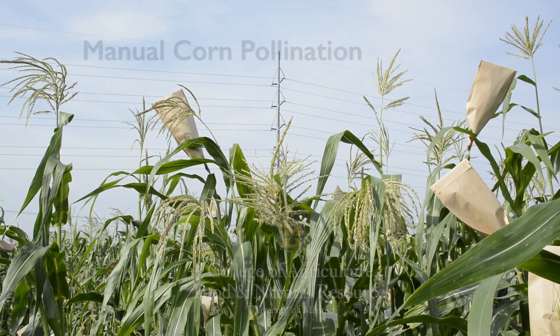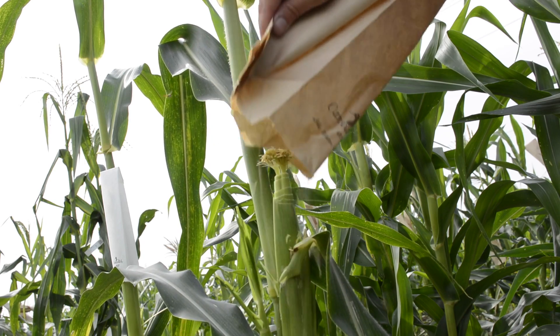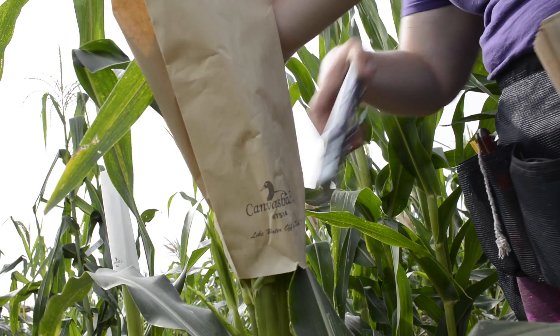Normally in a farmer's field, pollination occurs naturally. In the case of maize, each tassel produces millions of pollen grains and the magic of pollination happens without human intervention. But when geneticists and breeders want to do research, we need to know the parentage of the seed, so we make manual pollinations where we control the pollen from the tassel to the silk of choice.